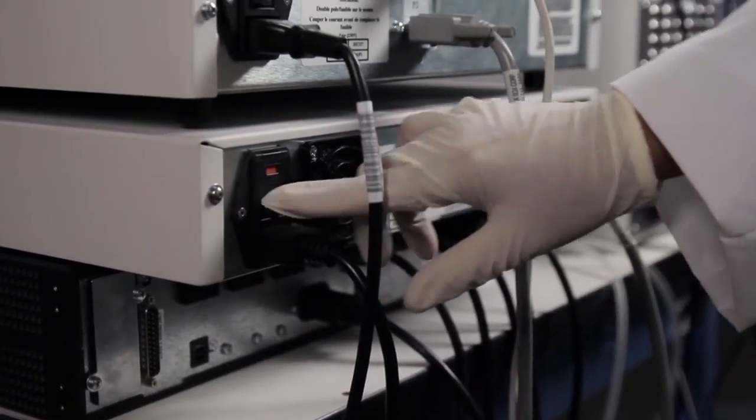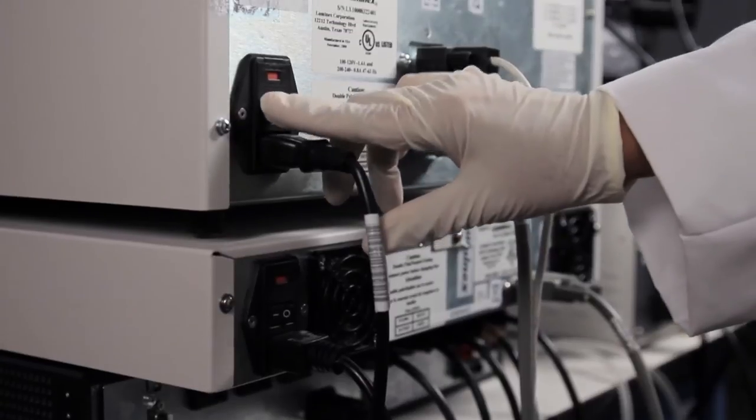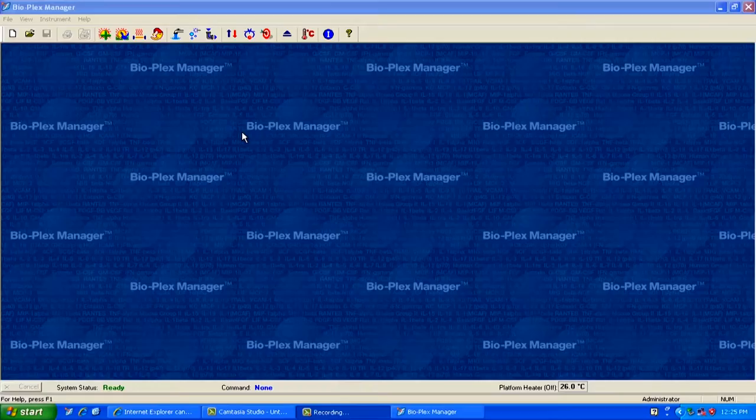First, make sure the Bioplex array reader and microplate platform are turned on and then launch the Bioplex Manager software.